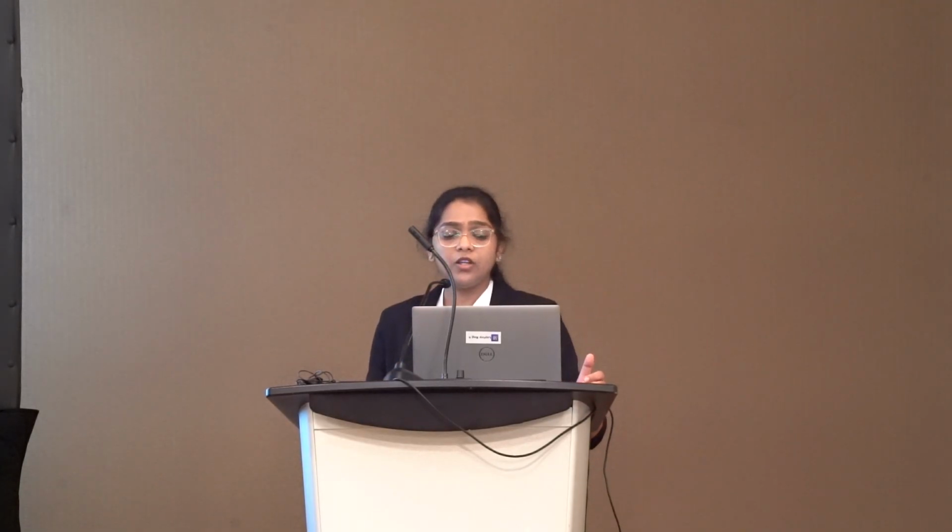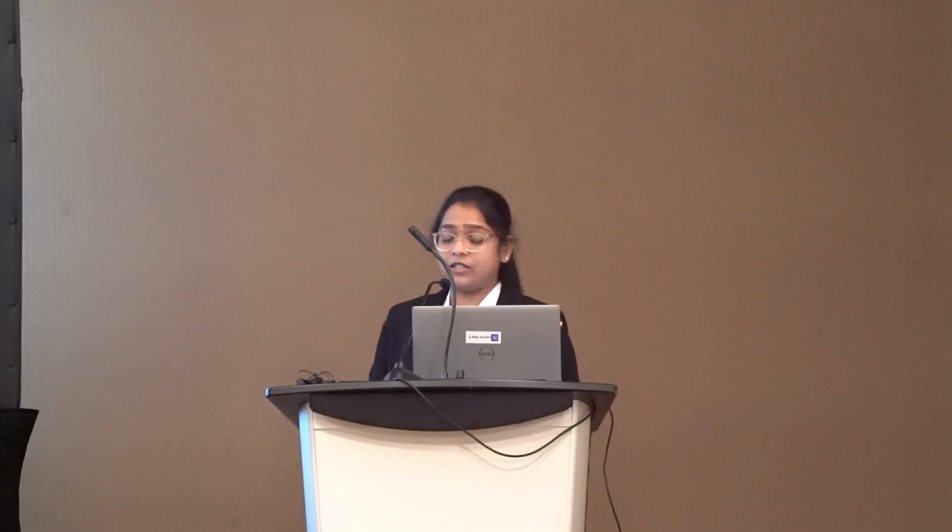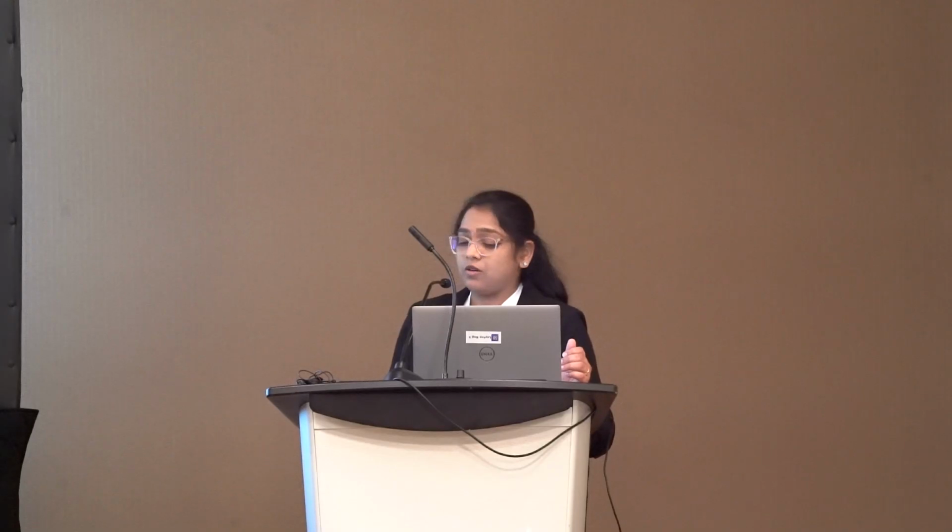And this is the MA plot. This shows the log fold changes across the genes, and the blue dots represent the most statistically significant genes, and we can see the widespread of changes or expression changes.